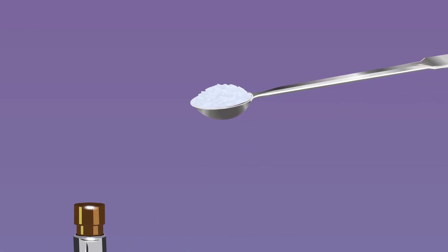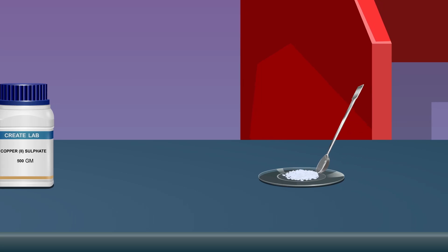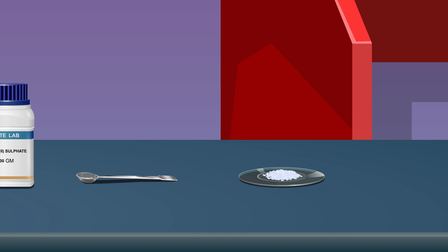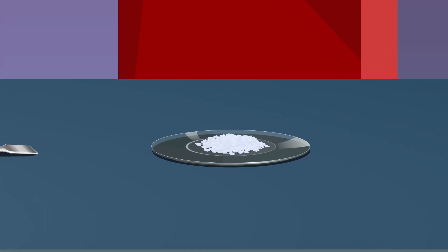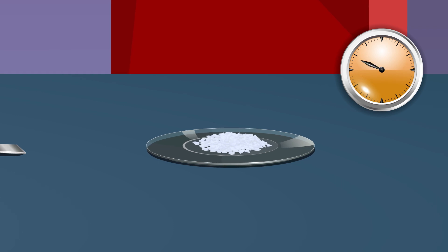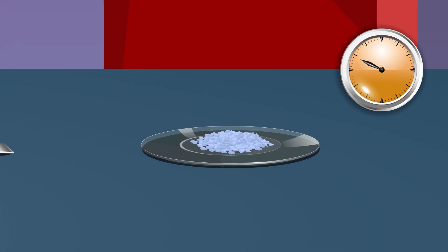Stop heating when it becomes completely white. Transfer the content to a watch glass, keep the watch glass in an open atmosphere for some time, and allow it to cool. We observe that the white color of the anhydrous copper sulfate changes to blue.